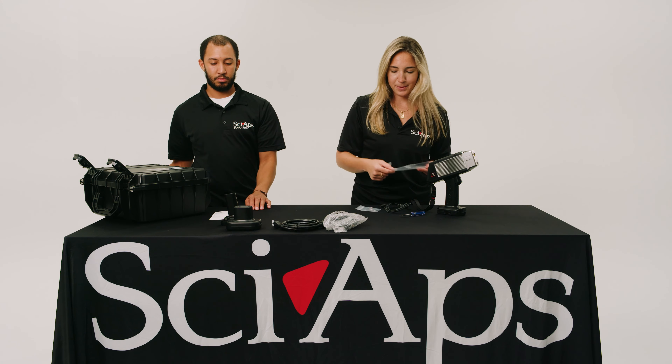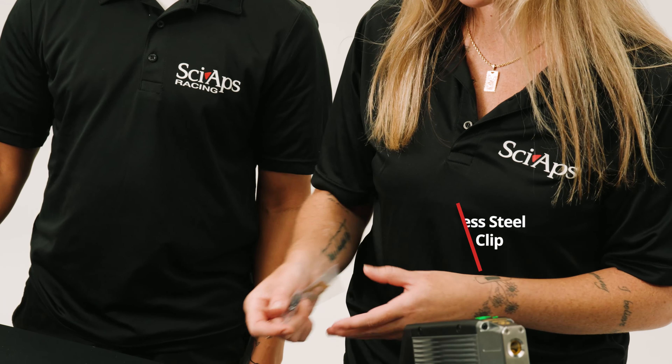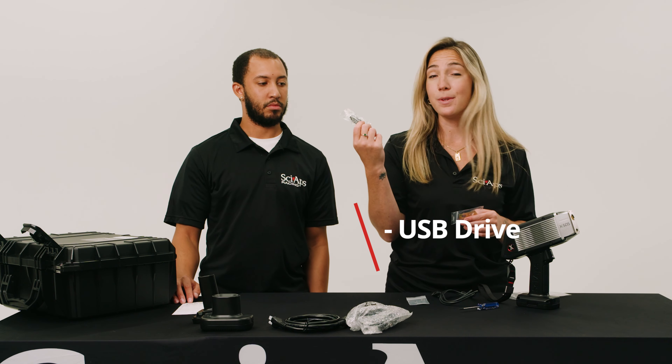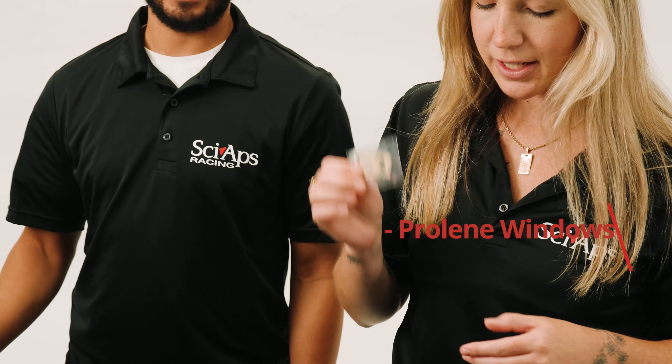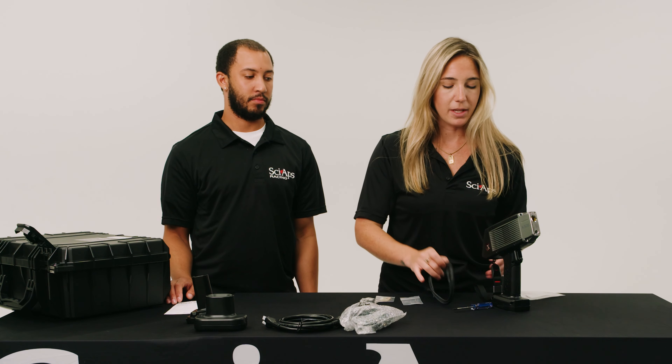A couple other things: we have a 316 calibration clip used to turn on the instrument and make sure it's calibrated and ready to go, a USB stick that has the manual and profile builder available to download, and also included are Prolean windows — or if you order an analyzer that has Kapton windows, they will be included.